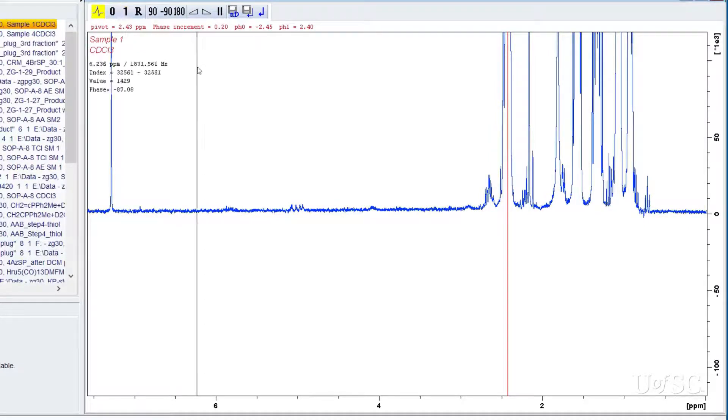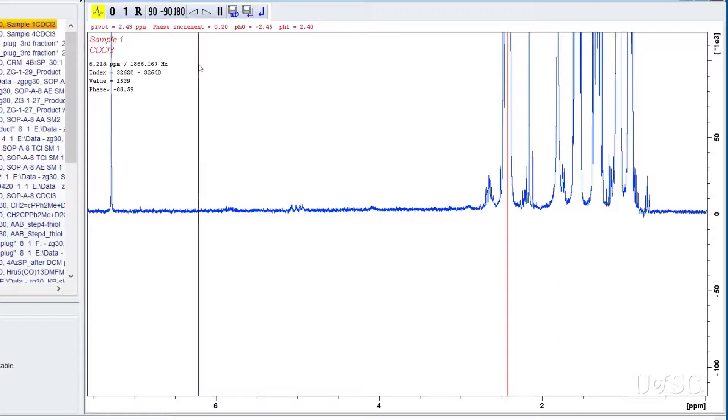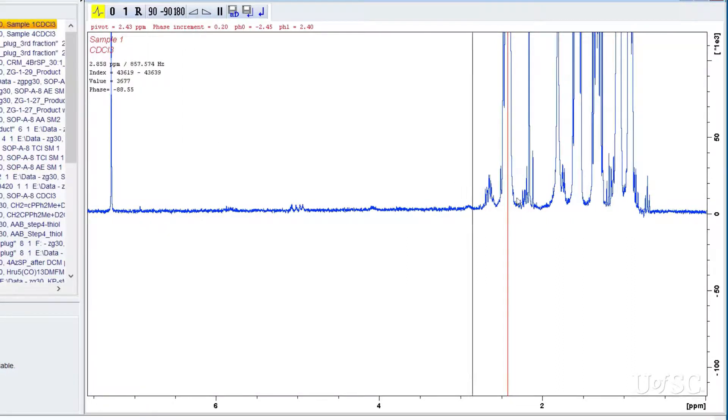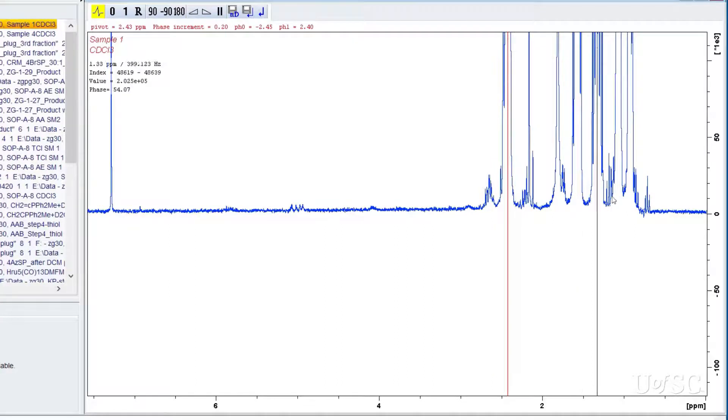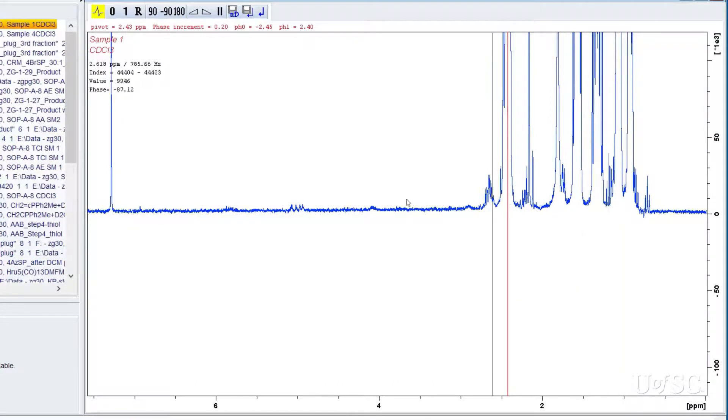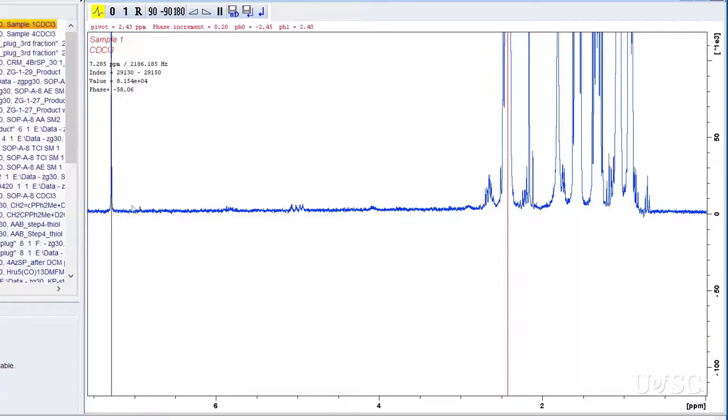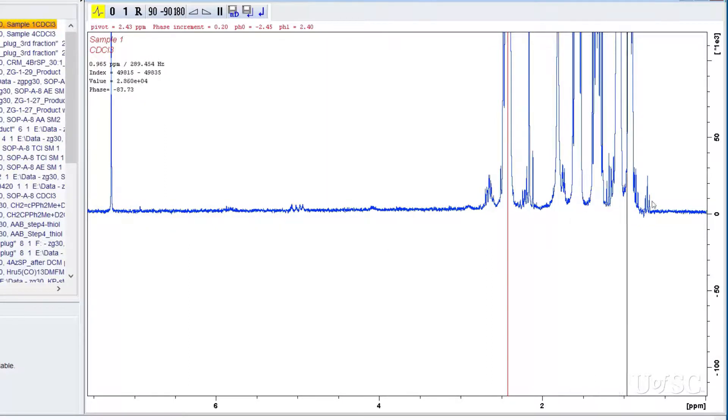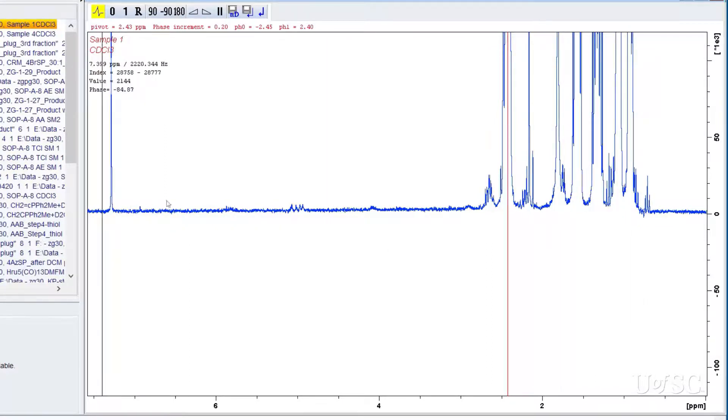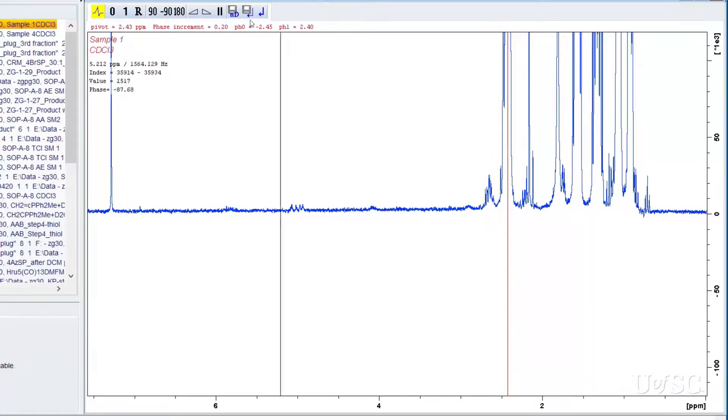When you are done with the first order correction you should look back at the pivot point to see if further zeroth order correction is necessary. If needed, repeat the process of zeroth and first order adjustments. All peaks across the spectrum should now be correct. When you are done you save and exit the phase tab with the button that has an old style floppy disk and return arrow. If you want to abandon any changes you made and revert to the previous spectrum you can hit the button with just return arrow icon.